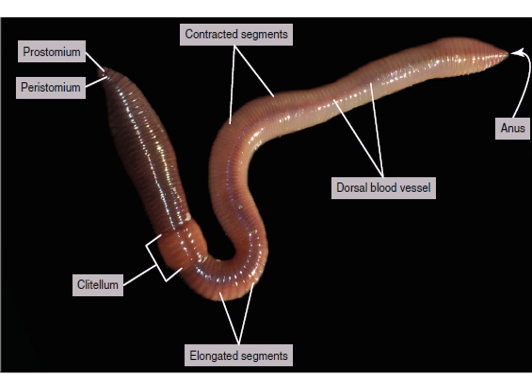And then the anterior side is more round as compared to the posterior side. The posterior side is flattened, the anterior side is cylindrical, it is round, and it is more pointed as compared to the posterior side. So we can identify the anterior and posterior side, the mouth and the anal side, by their morphological characteristics.